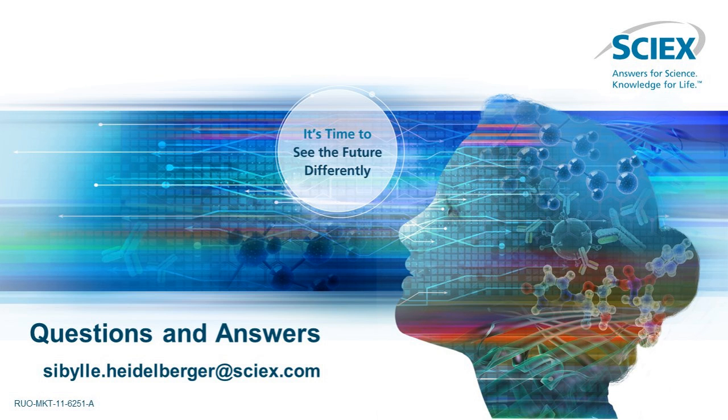When it comes to the identification and characterization, the MSMS data is really important in order to be able to identify things. Doing screening afterwards would be perfectly fine, but you do need to identify and characterize things prior to, so you do need that MSMS data. And especially in case there's anything like post-translational modifications that are occurring or there's localization of those, you do sort of need to get all of that information before you actually can just use a routine method just on the MS1 level.